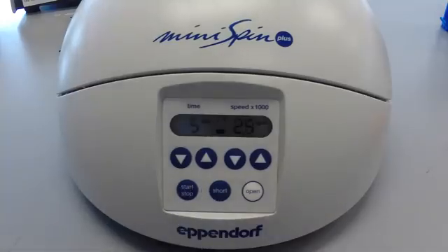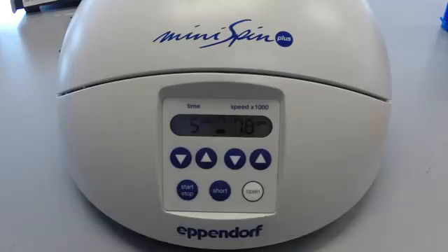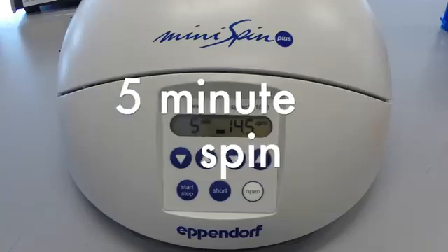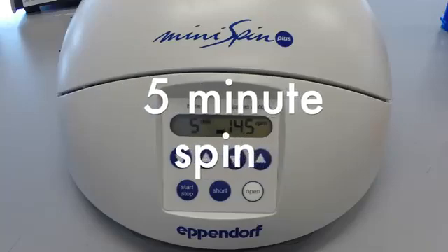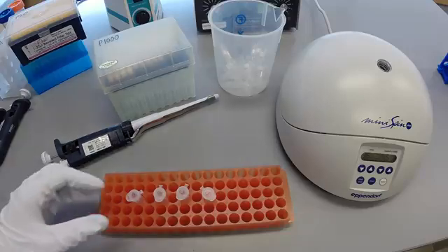It is suggested that you watch the centrifuge until it reaches maximum speed to ensure that there are no violent vibrations, which may mean that the tubes are unbalanced or the internal lid has come loose. If this occurs, press the stop button immediately. As the spin is going, obtain 4 new tubes and label them.